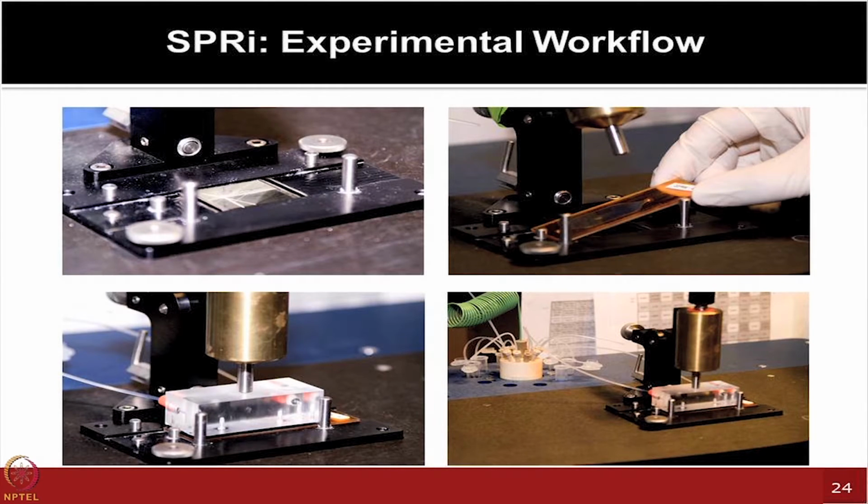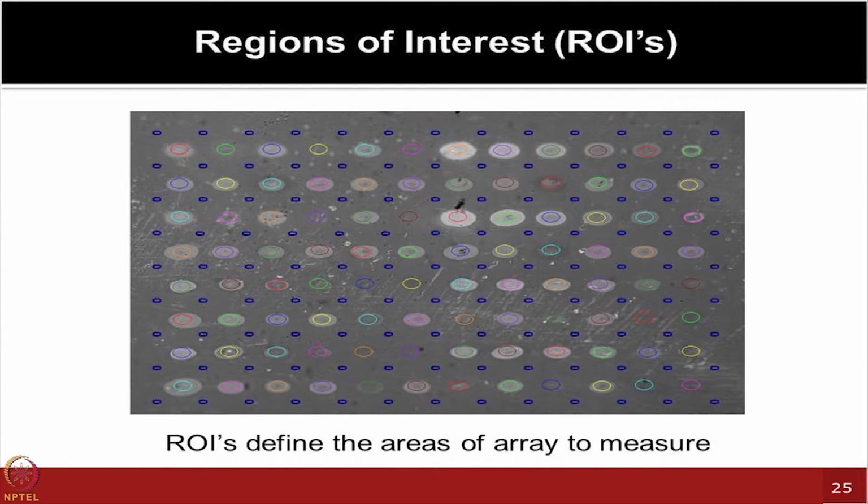So these kind of platforms could be used, and they result in these images, which are the pseudo images that I mentioned to you. It shows you these kind of spots. Now all these red and green ones are actual spots, but along with them, the gray color is just the background. So the software artificially adds some blue colored dots. These spots could be used for subtracting the background.